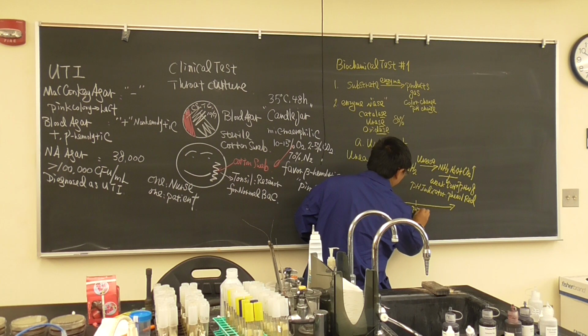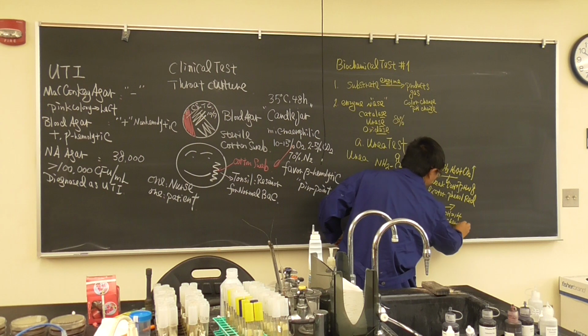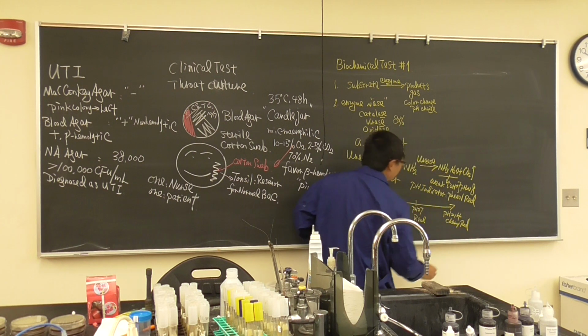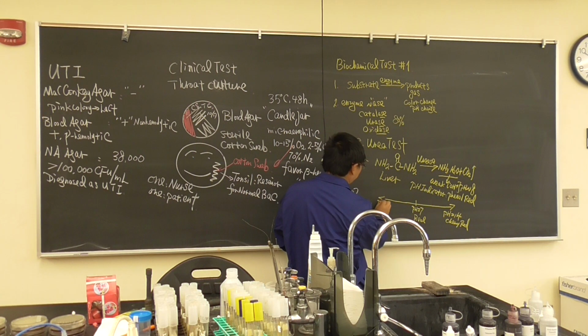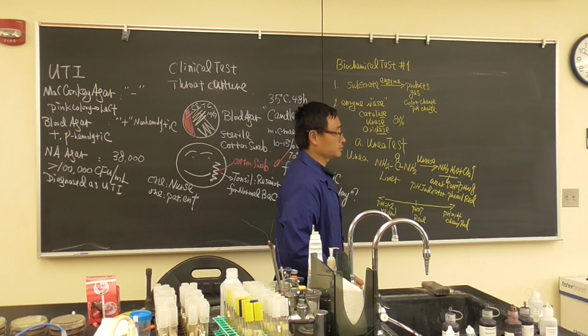At pH 7, it is its original red color. At pH 14, it is cherry red, even a little bit purple. And at pH 1 to 2, which is an acid environment, it is yellow. Okay? So that's why we can test it.